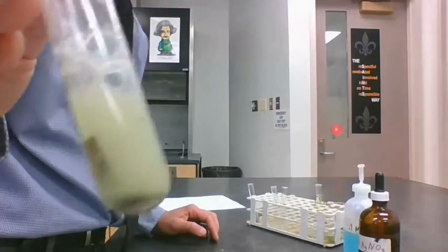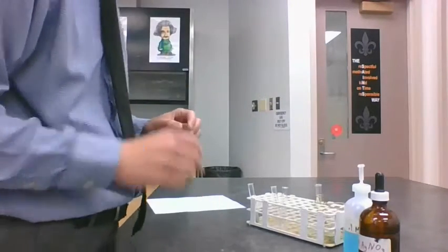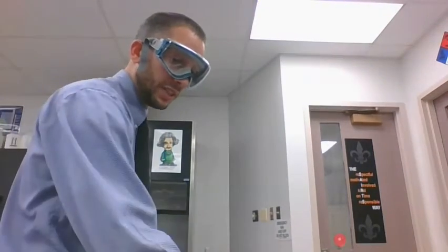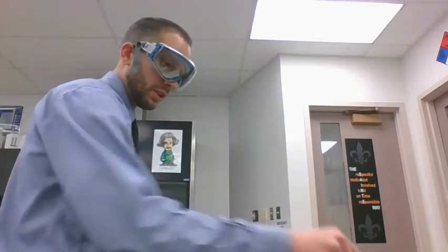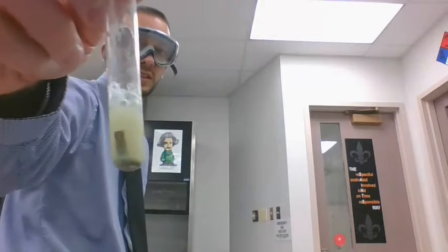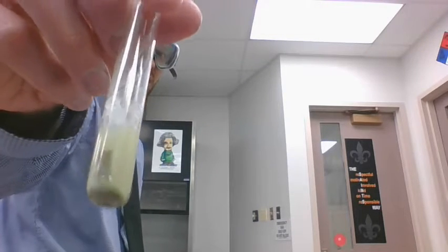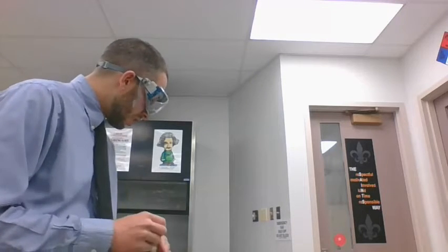That's what that solid looks like, a rust colored solid is what you end up getting on that first one. So we started with the magnesium, a piece of shiny metal, and this blue solution of copper chloride, and then we got this test tube that's a rusty colored solid and is not blue at all anymore.